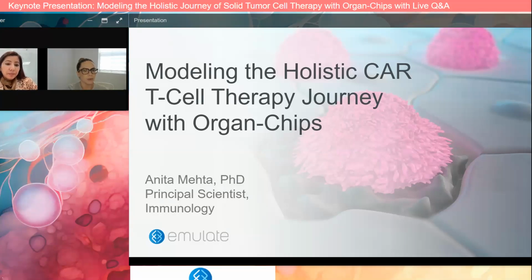Perfect. Yeah, that's great to know. Okay, it looks like we have two more questions here. So we will go ahead and wrap up with these last two. Second to last question here is, can you extract the recruited immune cells for flow cytometry analysis? That's a great question. Yes, we indeed did that with our workflow. The users are able to extract the immune cells. We do the enzymatic digestion for extracting the immune cells, and you can definitely look into the markers of interest.